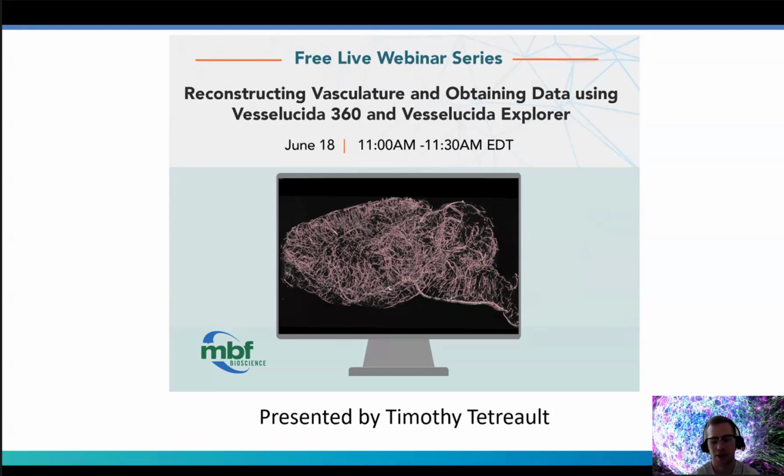Today, my goal is to provide you with an overview of our products, Vesselucida 360 and Vesselucida Explorer. And by the time this short webinar comes to an end, my hope is that you'll have a better understanding of one, how Vesselucida 360 works, two, what's possible for reconstruction within that program, and three, what sort of data you can collect from Vesselucida Explorer. There are a lot of different capabilities and possibilities with both of these programs, so rather than just talking about them, I'm excited to share what they can do.